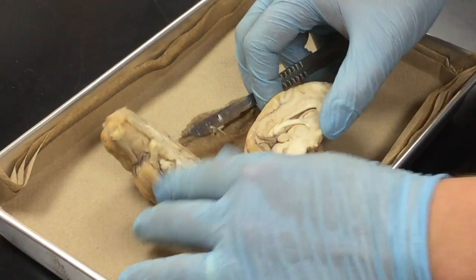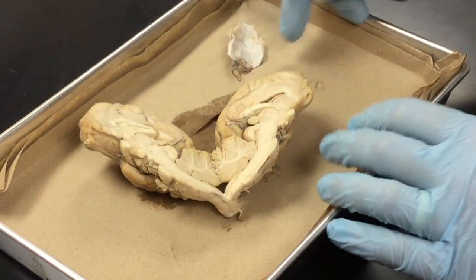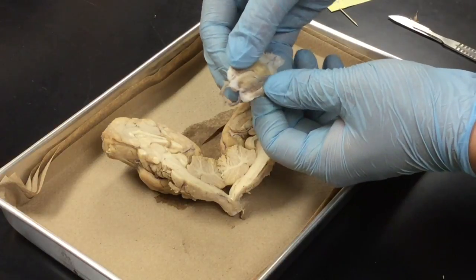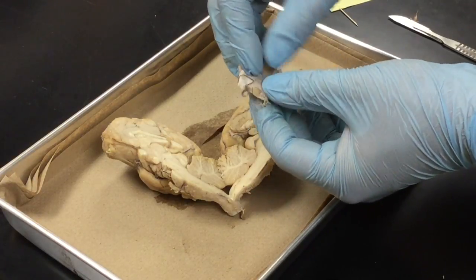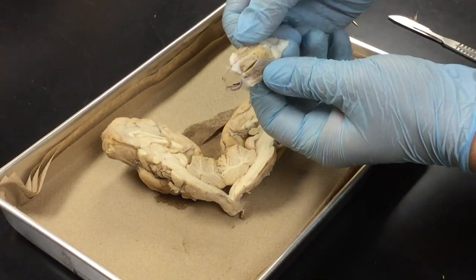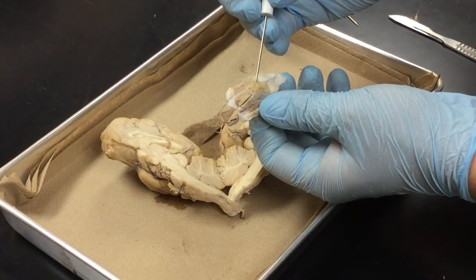So you want to cut your brain in half, like so. As you saw when I was cutting, this part of the brain came off. This was due to the dense connective tissue that was connecting it to the brain itself. But located within this connective tissue right here is actually going to be our pituitary gland.